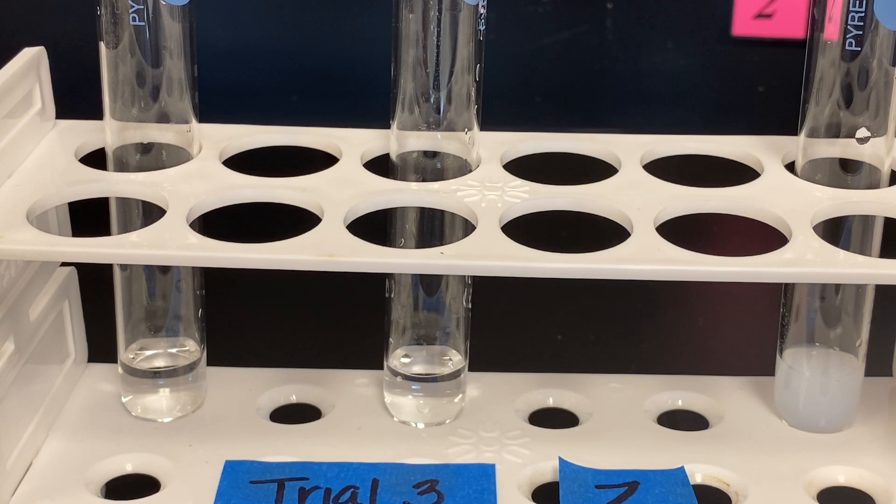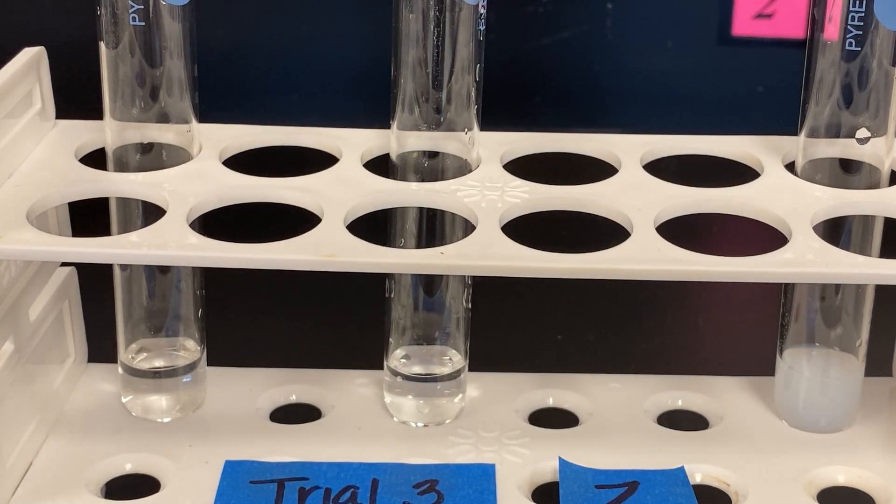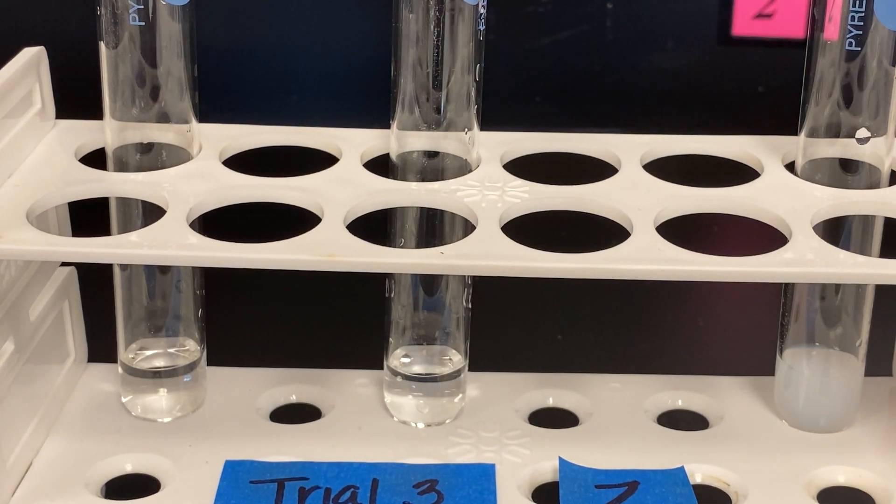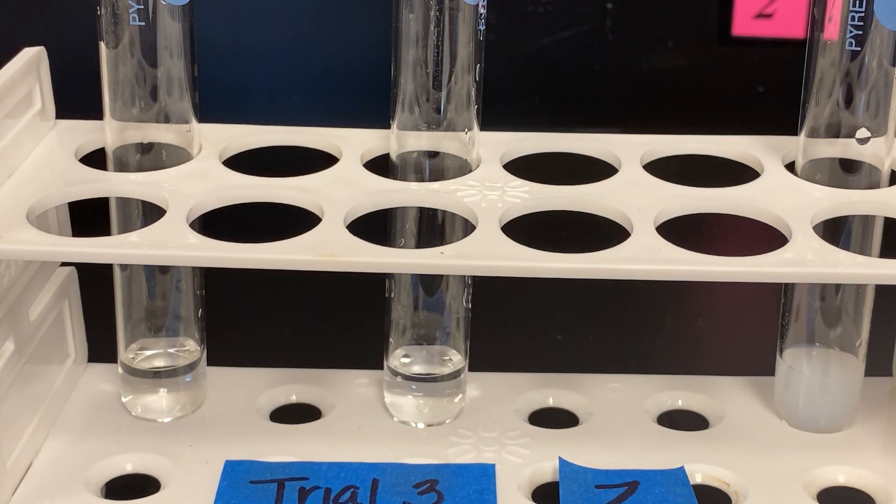When it's time for you to write your analysis, you should write a summary of what you saw compared to what you had originally asked. For example, in my analysis, I could see that the results varied based on the unknown solutions mixed together. When a solution is mixed with itself, you will annotate the reaction. But when solution X and solution Y were combined, and then you would record your reaction.